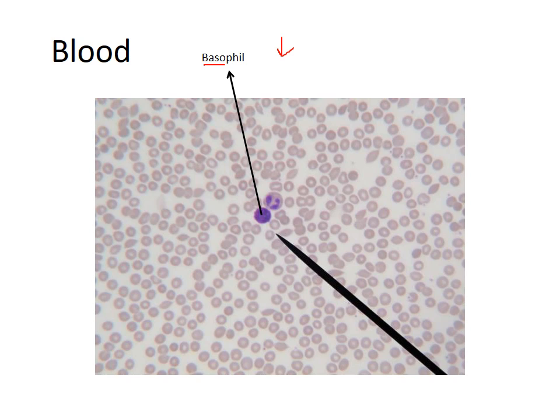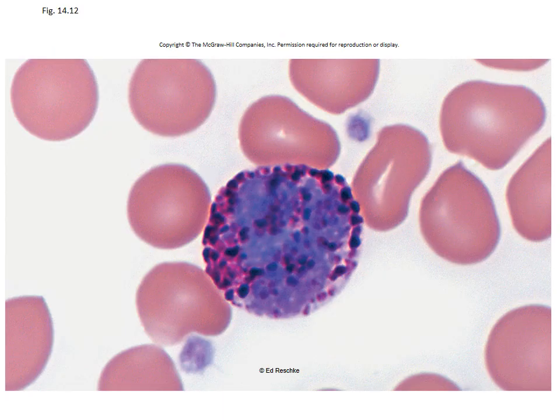Now the basophil, we're going to see on this next slide, has very dark purple blue granules. I've had students describe them both as blue or as purple, and I've said it either way, but they're really dark blue purple granules. Again, it looks like a bag of purple marbles or blue marbles. Now, again, it has the multi-lobe nucleus in here, but you can't really see that. So that's not the star of the show. The star of the show are these very dark purple blue granules. And again, this is called the basophil. It is the least common of all the white blood cells.